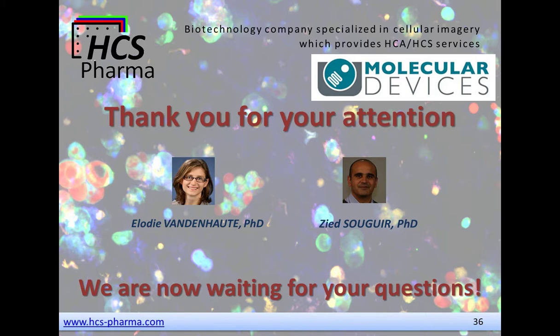How many cell images can you catch from a 384 well plate for imaging analysis?